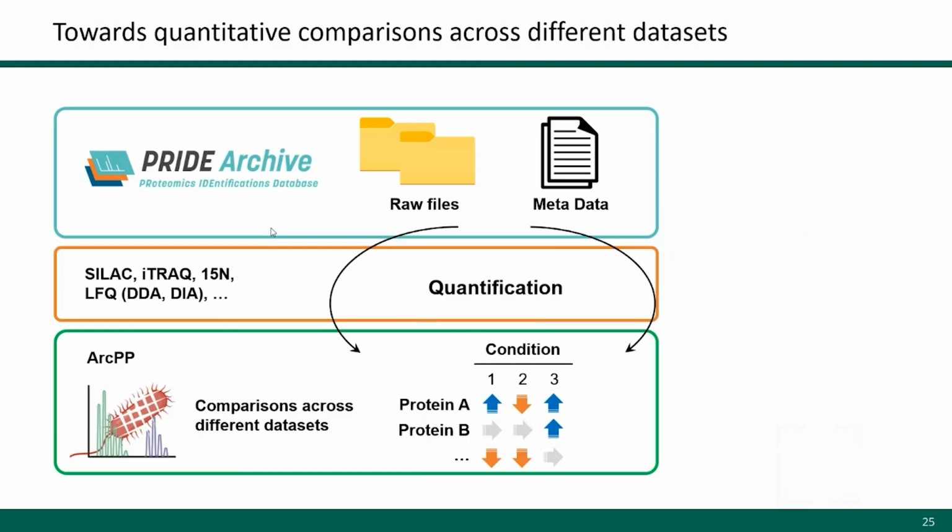So we have some methods for label-free quantification, as mentioned by a lot of students as well. We're still struggling a bit with some of the labeling approaches, but hopefully we'll get there. And then, of course, nowadays a lot of DIA is being used, which creates additional challenges on the bioinformatics side, but also really exciting results. So yeah, we'll get into those soon as well.